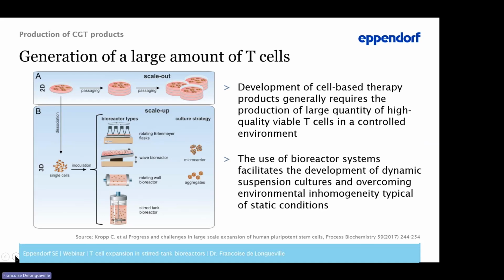Even with some automation for those 2D cultures, this approach remains relatively cost, space, and labor intensive. In addition, those approaches do not include any online monitoring and control of the key parameters of the culture, like cell count, dissolved oxygen, pH, glucose, and growth factor concentration.